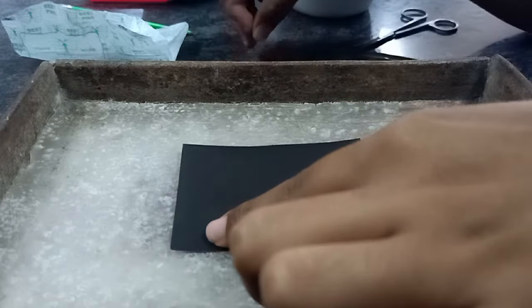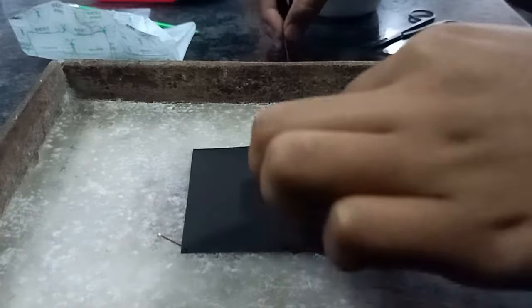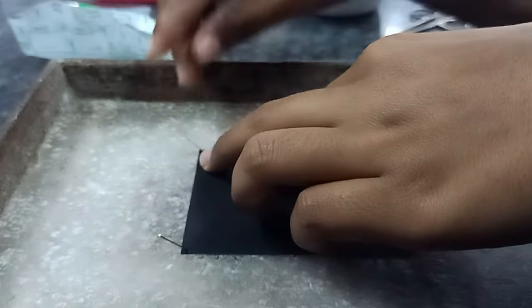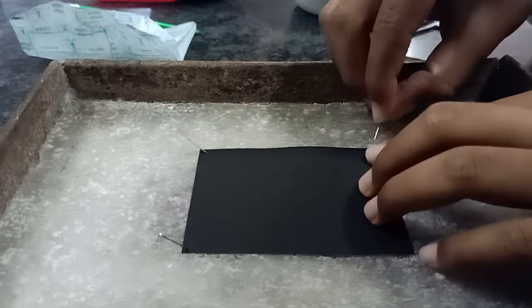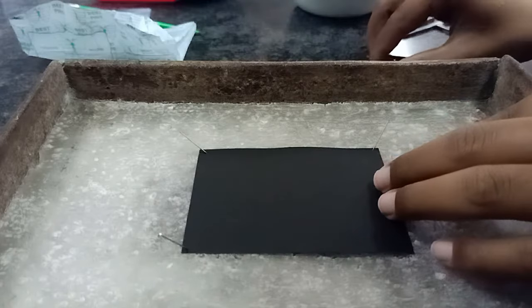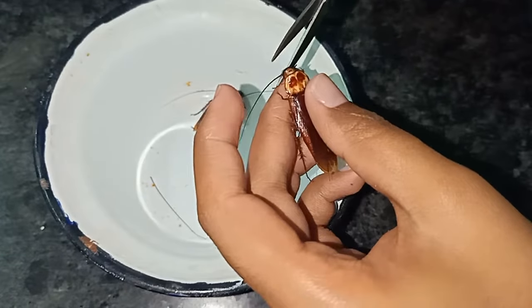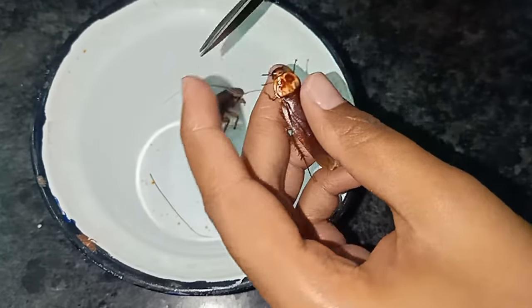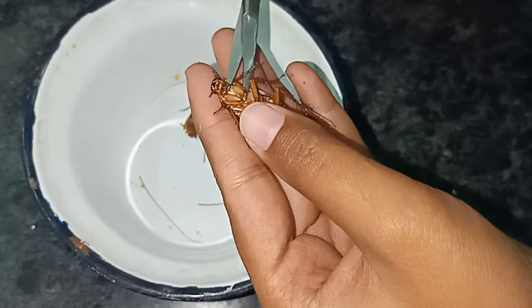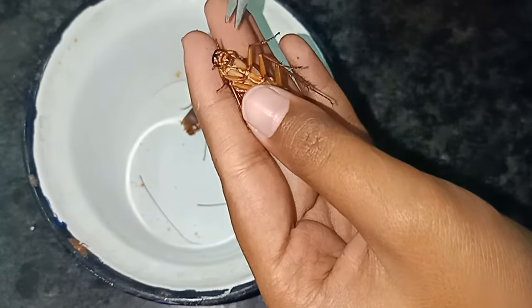Place a black chart at the center of the dissection tray and pin it tightly using bell pins at all the corners. Once again, make sure the chart is held tightly. Hold the cockroach in your left hand and clip off the antenna, legs, forewings and hind wings. These clippings must be done close to their bases so that the cockroach is well placed in the dissection area.